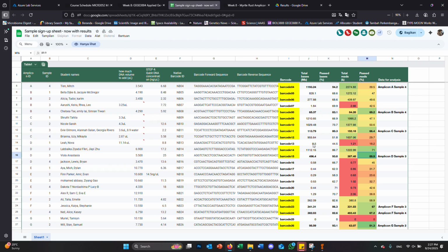Speaking of read, what else is different? What else is different about the two sort of the base pairs of these two files? So we've got way different lengths. The lengths of our reads are completely different. If you look along the position in our Illumina data, it maxes out at 150, and that's because our data is 150 base pair reads. Our Nanopore is any length that it can happen to sequence on that given run.